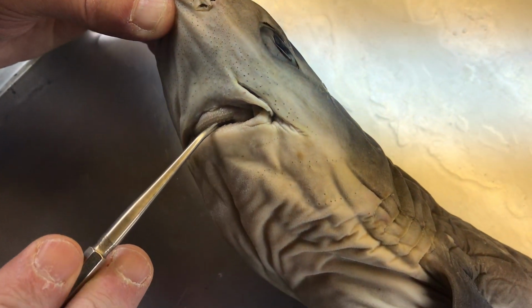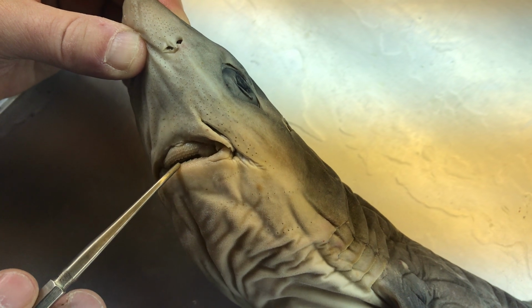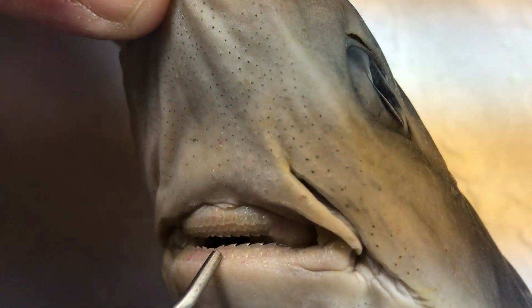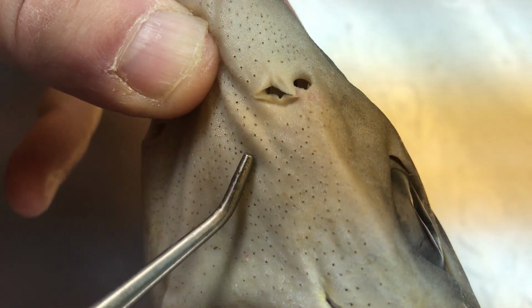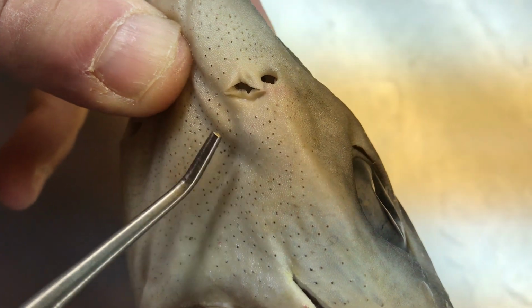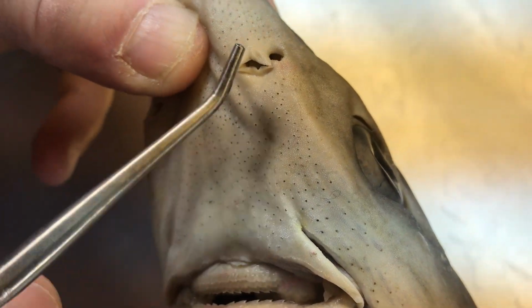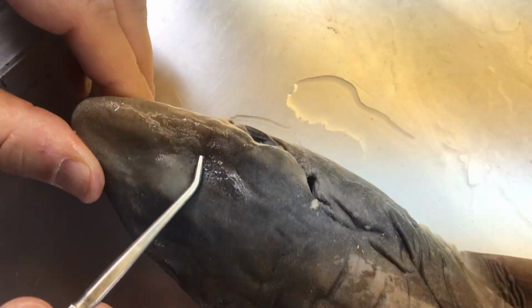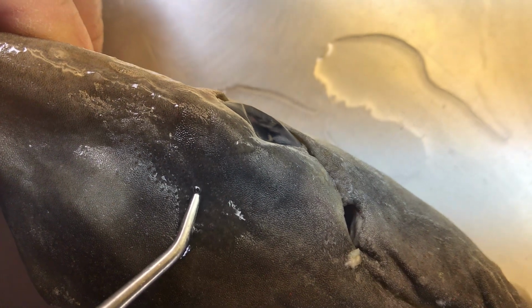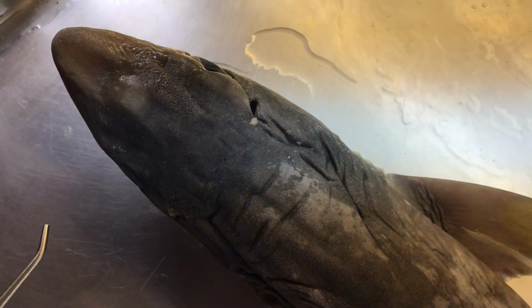Then we have the mouth, the business end. The teeth are modified placoid scales. Other features are the ampullae of Lorenzini. All of these openings here, we can see fluid coming out. Those ampullae of Lorenzini are widely spread out on the ventral surface of the head, as well as the dorsal surface of the head. These are for electroreception.